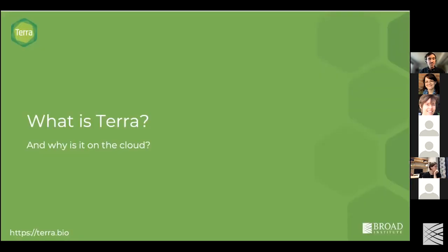So let's take a few minutes to talk about what Terra is, what's the motivation for Terra, and what can we use it for. Over the next about 19, 20 minutes, I'll do that short introductory slide presentation. Then we'll actually take a look at the application and get familiar with what the workspace looks like and what the functional component of Terra looks like. That'll set you up for the next section, which will be a bit more detailed and hands-on.